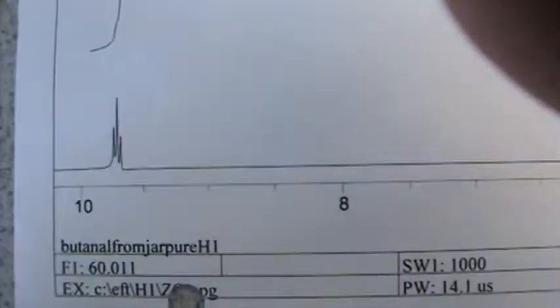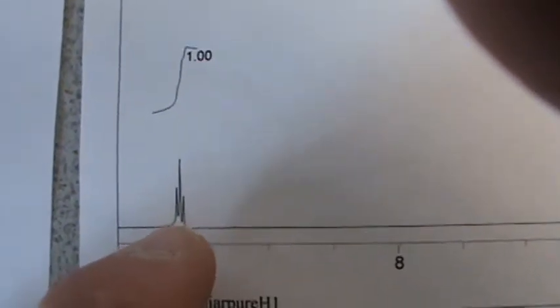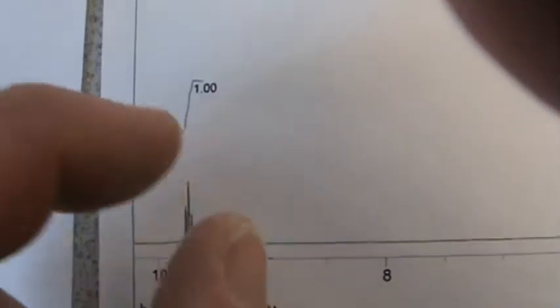This is the reference material of the product we intend to get. So this is pure, came straight out of the bottle. So way down at almost 10, you can clearly see how you have the aldehyde peak. One thing I want to stress though, folks, do you see the phasing? Do you see how the baseline is here? And there's a little bit of it that dips down there. Whenever the phasing of this peak is slanted a little too far this way, in this case it's slanted like this way, that integration you can't necessarily trust it.